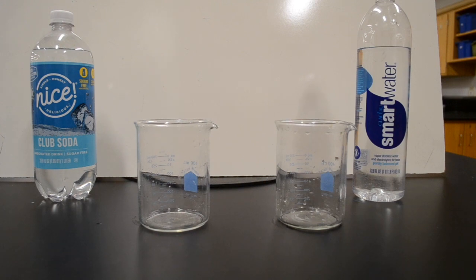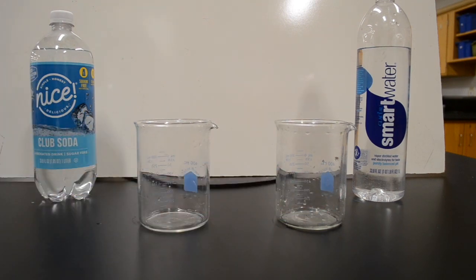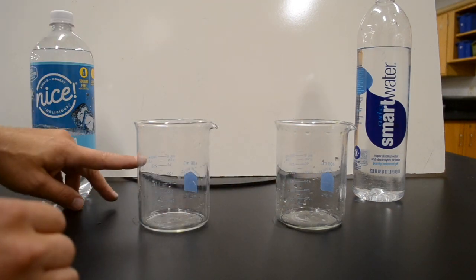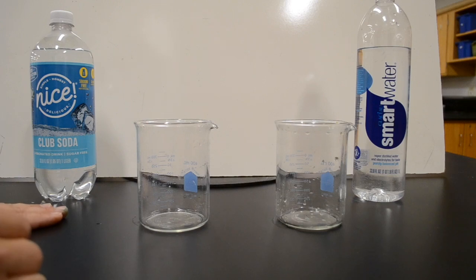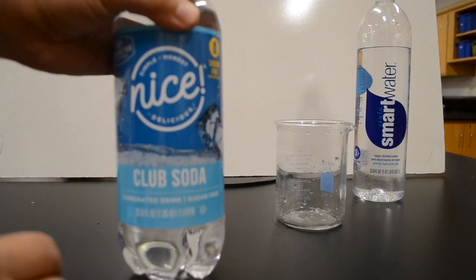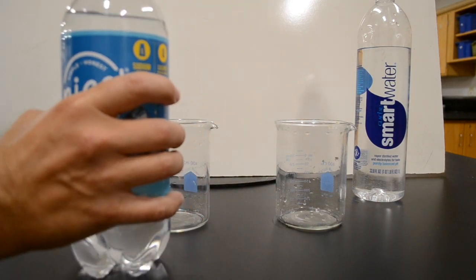Okay, in experiment number 1, we are going to fill up two 400 milliliter beakers. So the beakers are the exact same size. We're going to fill them with 300 milliliters of water. Now, one of the waters is club soda water. This means that it has carbonation or bubbles inside. So we're going to add 300 milliliters of this.